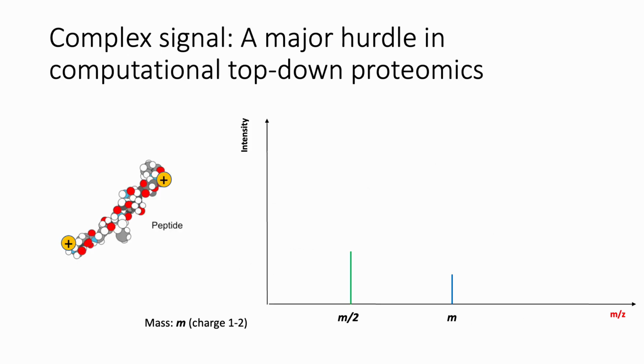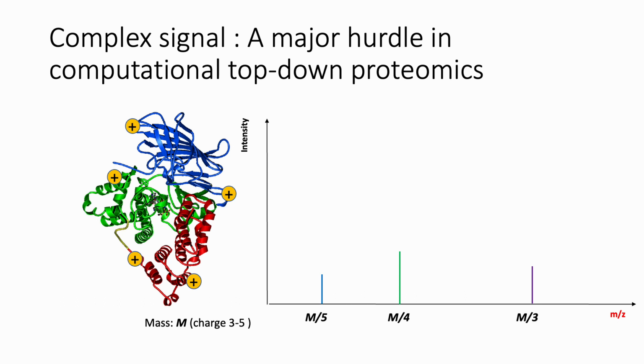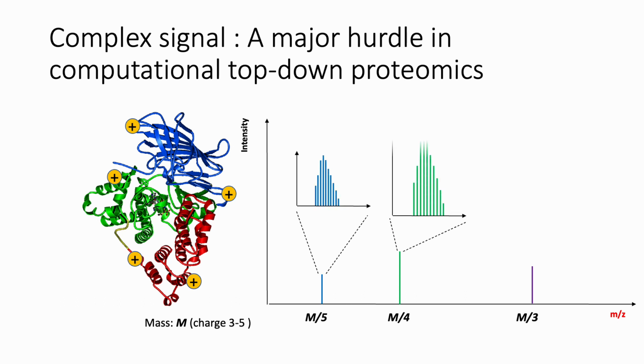Okay, then how do the actual peaks from proteoform ions look? Now we shortly come back to peptide ions before we see proteoform ion signals. Due to relatively small masses, peptide ions often have small charge values, and also they usually come with small numbers of isotopes. But in the case of proteoforms, they generally have wider charge ranges and so many isotopes.